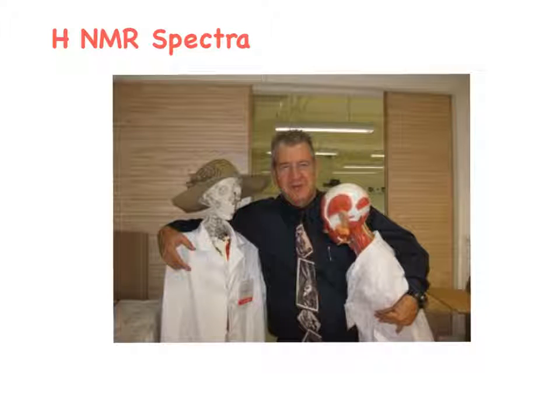We don't often get a chance to look at other systems that we don't actually use in the lab at school. But this method is actually one of the ones that's going to be tested in your exam, so we need to have a bit of a closer look at it. So let's have a look at hydrogen NMR spectra.